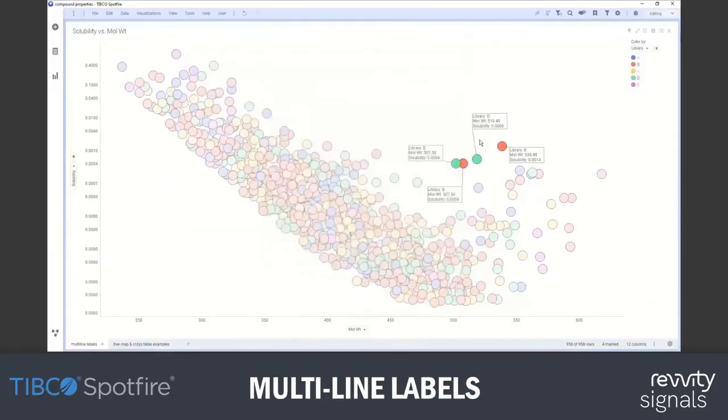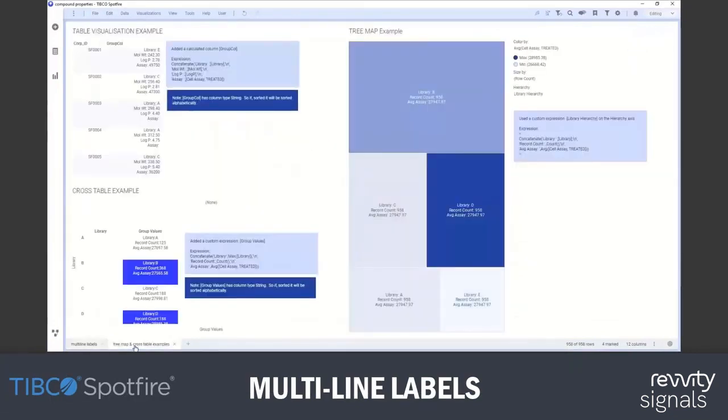But it's not just restricted to using that same trick in scatterplot labels. You can also use a similar approach in tables. Here I've taken a collection of values and represented them in a single cell and placed them each on a new line. And similarly in the cross table, I've taken a similar approach by taking a series of aggregated metrics for a library and shown them in a single cell.